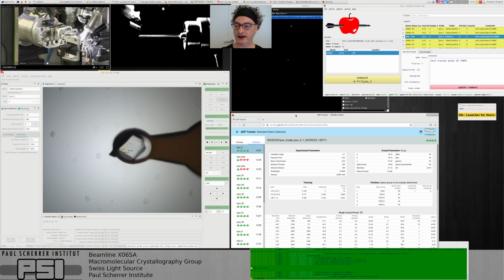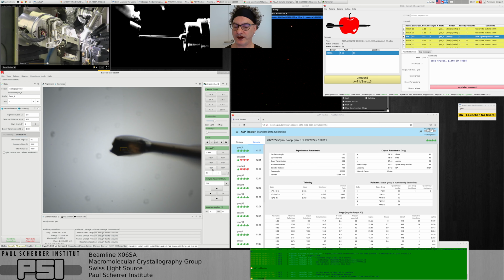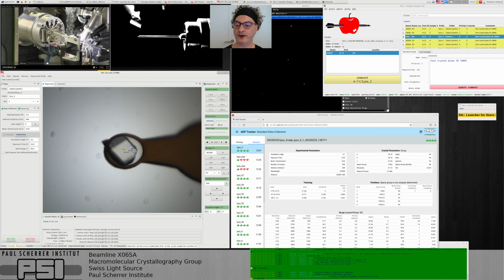Alright, so interacting with the SmarGon. Usually we have buttons on the GUI on this side that we can use to turn the sample as you see fit, 45 degrees or 90 degrees or 10. There are shortcuts, to prevent the scientists from having to look away from the sample and miss maybe important things.